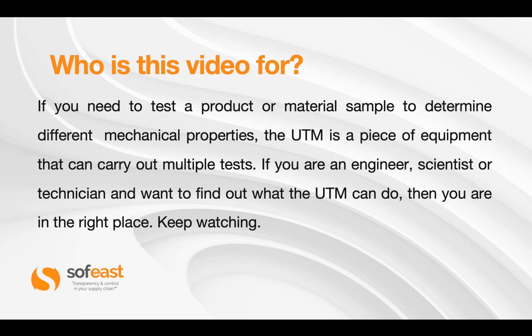So, like I said, who is this video for? If you need to test a product or material sample, determine what the different mechanical properties are, the universal test machine, or commonly known as the UTM, is a piece of equipment that can carry out multiple tests. If you're an engineer, scientist or technician and you want to find out what the UTM can do, then you're in the right place, so keep watching.